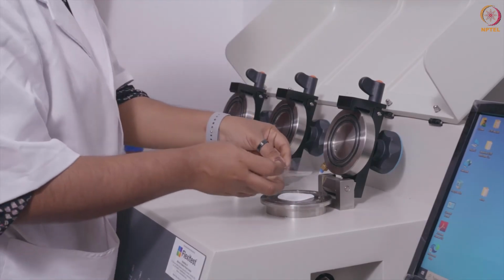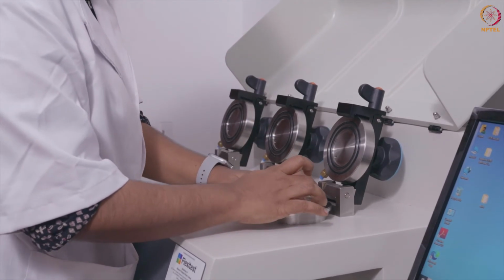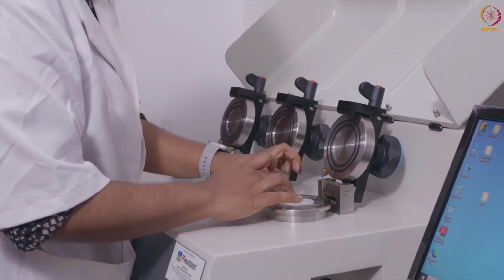The preconditioned test specimen is mounted in the gas diffusion cell so as to form a sealed barrier between the two chambers.